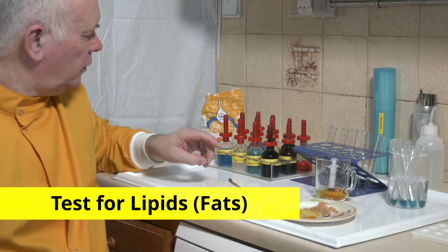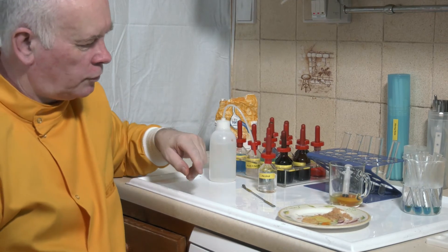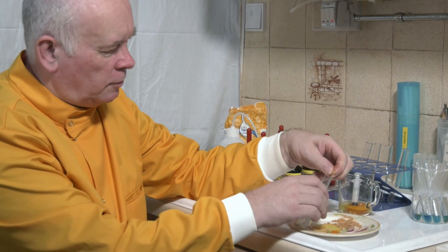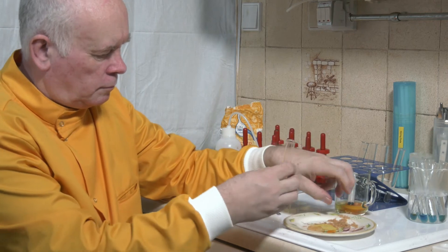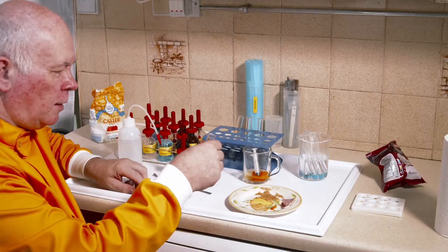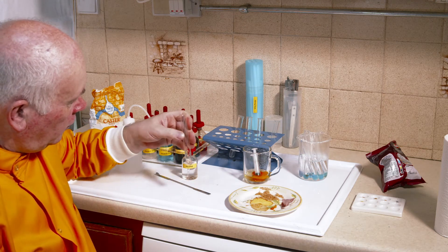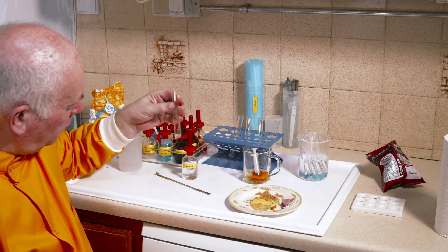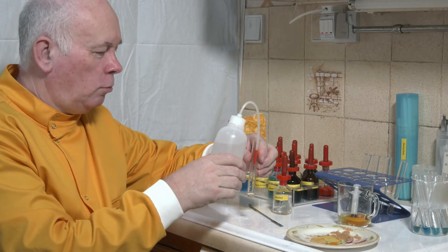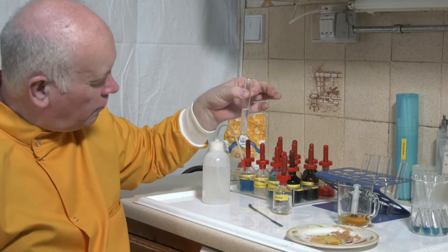The final test is looking at fats, and for that I'm going to want some alcohol and some water. In this test we take some breadcrumbs, add a squirt of alcohol, and shake it up. What I'm trying to do is to get the fat, if there's any in there, to dissolve in the alcohol. And then we can add some cold water. If we've got any fat present, then that will turn cloudy.